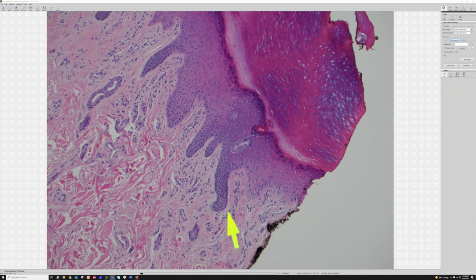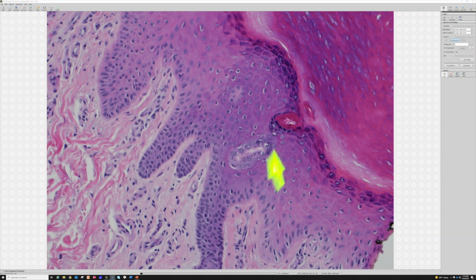And here it's connecting to the epidermis, even though you can't see the lumen, the little center part, because we've not cut quite into it, right? If we cut a little bit deeper into the tissue, you'd see that lumen there. And then closer in here, the lumen shows up again. As it comes out, there's some little granules. Some of those keratohyalin granules are getting into the opening. And then here it empties out onto the surface.